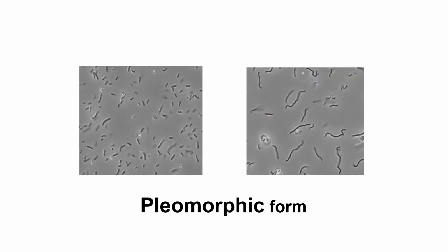The two microscopic images are the cultures of Limosilactobacillus reuteri but grown at different environmental conditions. This pleomorphic behavior has been observed before and might be an environmental stress response when exposed to a certain condition that has not been studied extensively. In this project, I wanted to systematically study the influence of process variables on cell morphology and correlate it to growth and freeze-thaw and freeze-drying survivability.